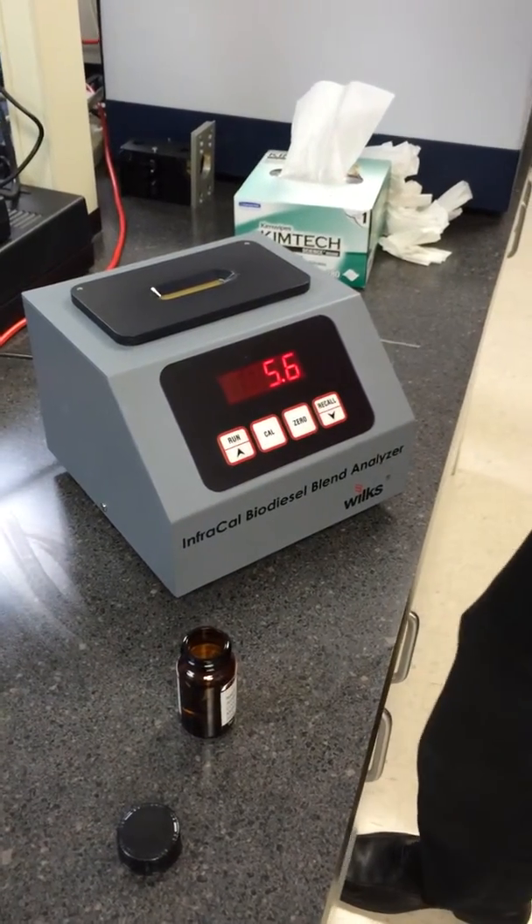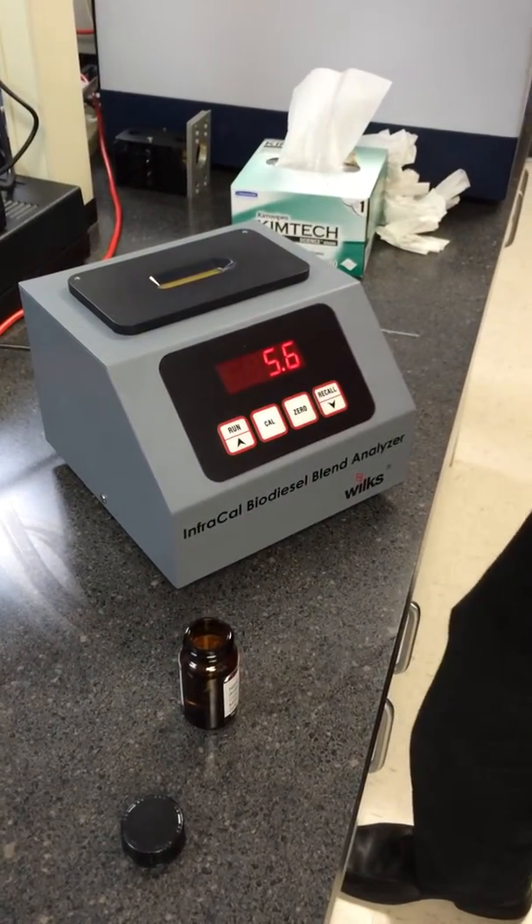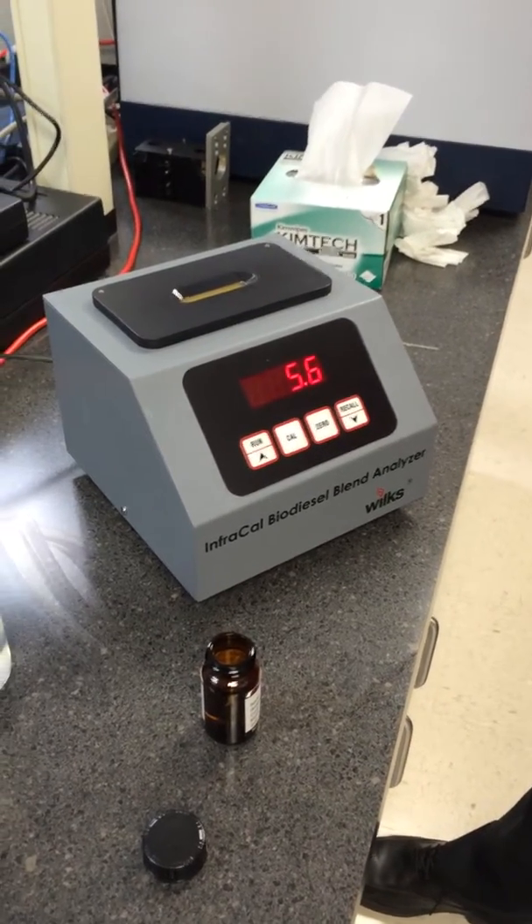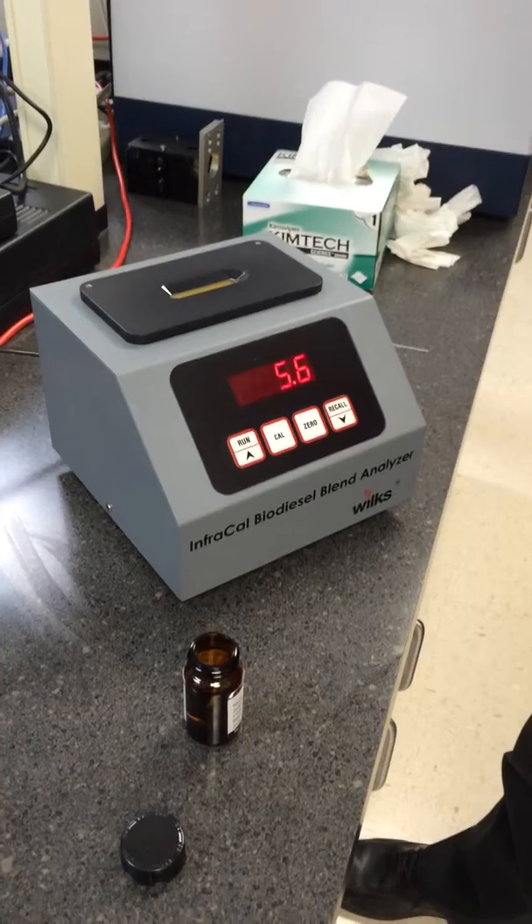Before starting your analysis, make sure to plug in the instrument for at least one hour. After that hour has passed, you may begin your analysis by first zeroing the instrument.